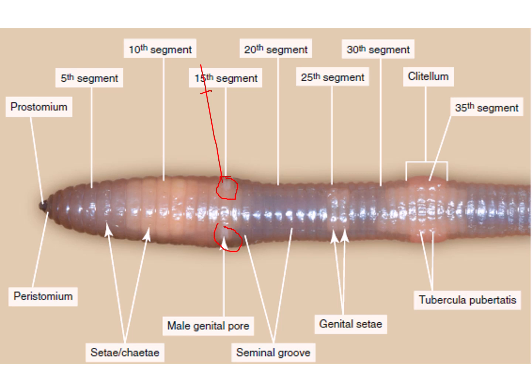Here the testes would release the sperm, and during copulation these sperm are transferred to another individual, and when they are transferred, they would go to another organ of the earthworm, called the spermatheca, in the second individual. So this animal is also having spermatheca pores.